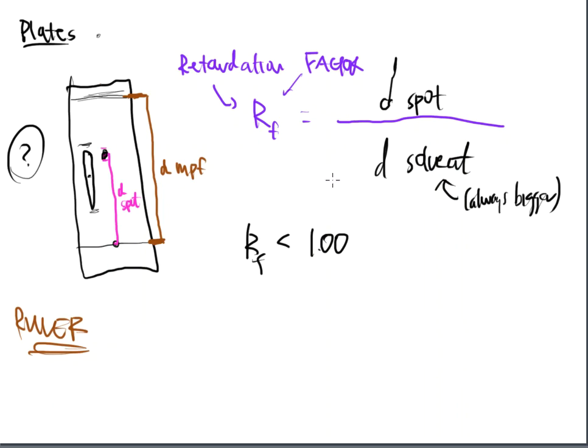Okay? Now let's take two examples down here at the very bottom, and let's relate this to something that we've talked about earlier. Let's say that I've got two plates, and I've spotted a sample on each one. Here is my mobile phase line up at the top. I've marked them. I've developed my plate. I see the spots, and now the spot is showing up on the plate.